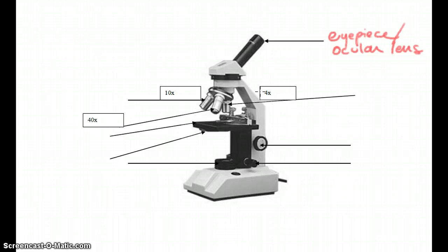Here we've got just below it these lenses that are hanging off the microscope, and this part that this line is pointing to, I think previously we've called it a low objective lens. We're going to call this one the scanning objective lens. So this is really the one that we start with when we start viewing or looking for cells. And I'm only writing down the names of things. I want you to also jot down what we use that part for. That's what you need to know because you're going to be using the microscope, so you should know what the parts are and why we use them, or how we use them.